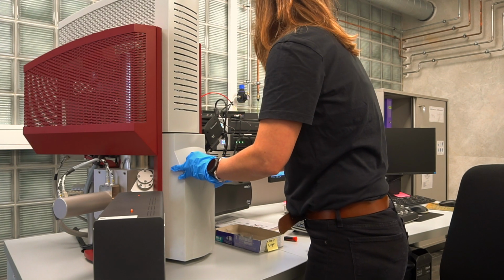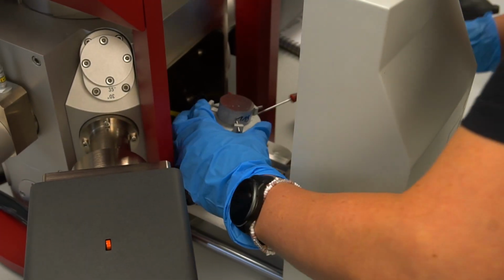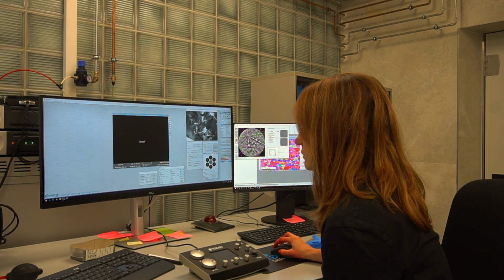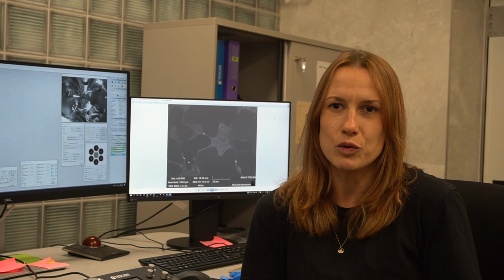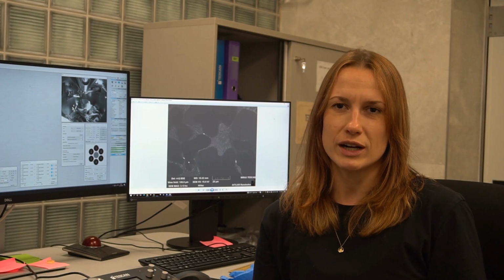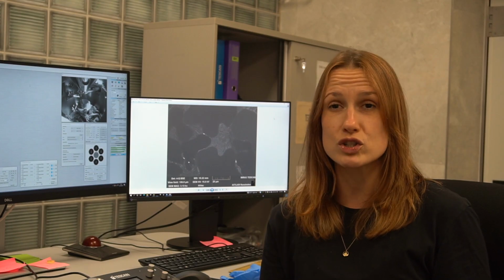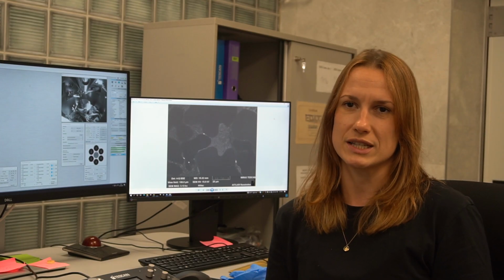And especially when it comes to intermetallic phases, the morphology really counts. So depending on the generation of these intermetallic phases, we can somehow derive mechanical properties. And at the end of the day, mechanical properties are what we are looking into for material design and alloy development. Because if we have industrial applications, they don't necessarily care much about the microstructure, but they want a specific tensile strength, a specific corrosion behavior, and specific ductility, like for crash components, for example.